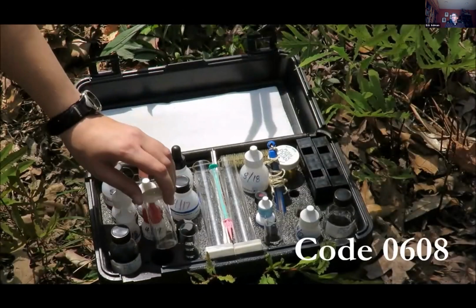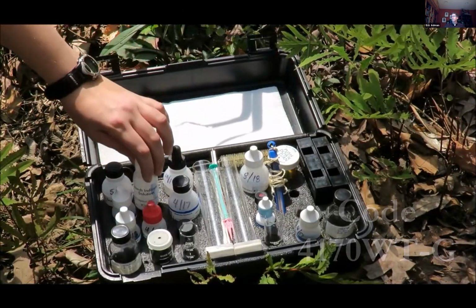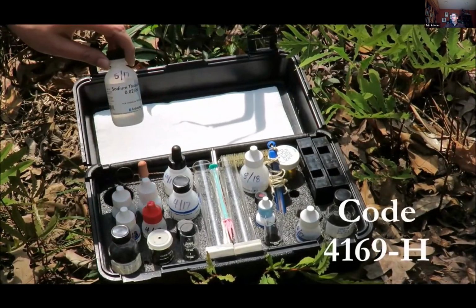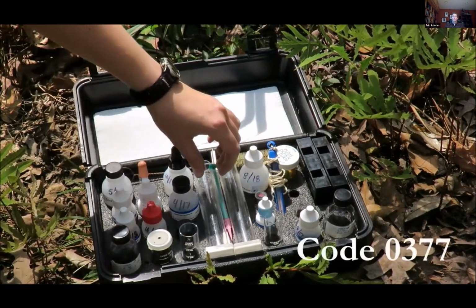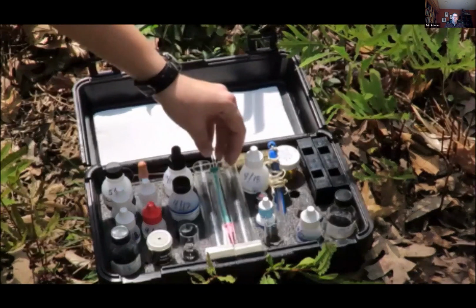For this step, you will need a titration tube, starch indicator, sodium thiosulfate, and the direct reading titrator. This entire process should be completed for one sample before starting the second sample.